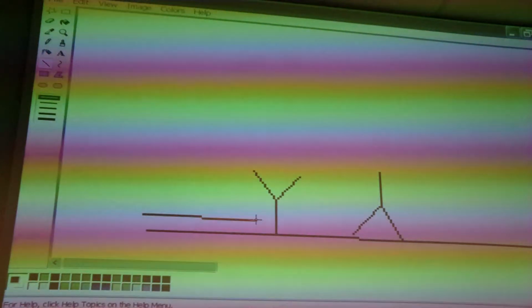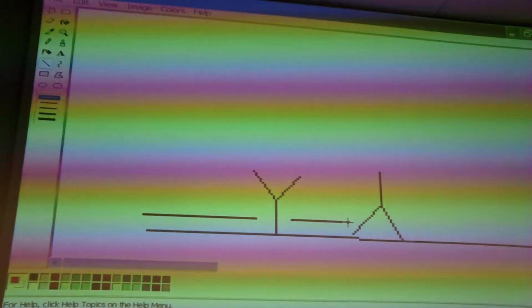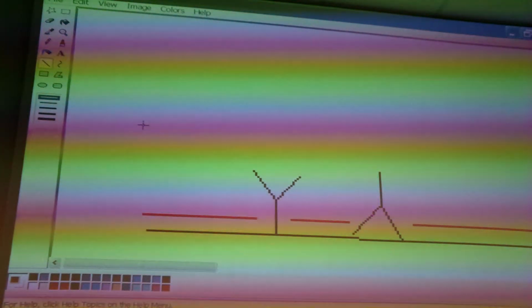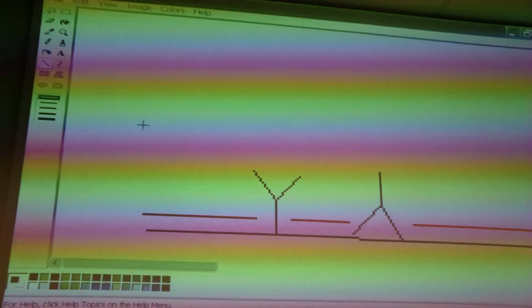How are we going to block the surface? With what? Yeah, now that's going to help us. So this is, do we have text here? No, I don't have text. So this is BSA. We have to write it down. The red is BSA. Now it's good, right?